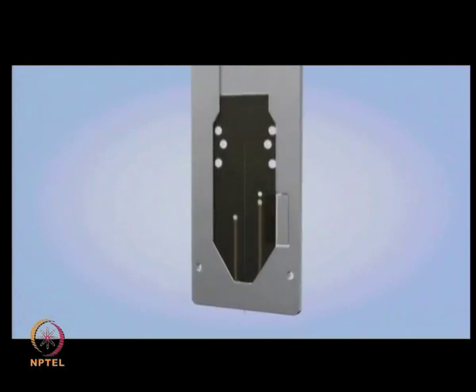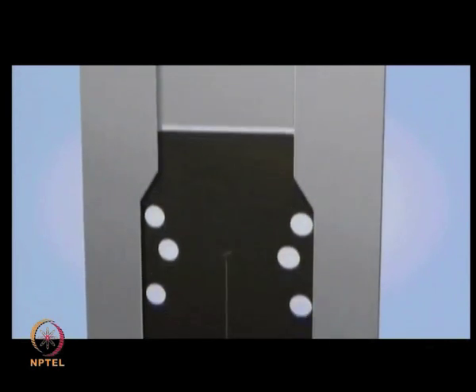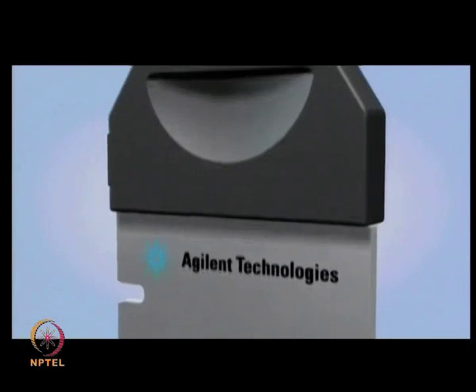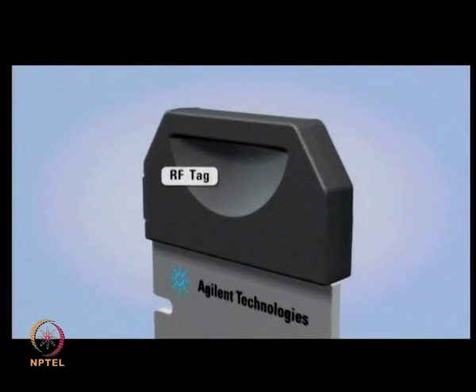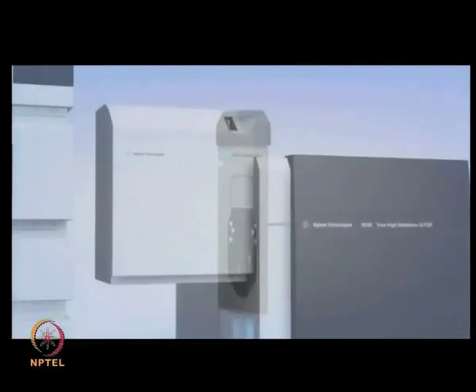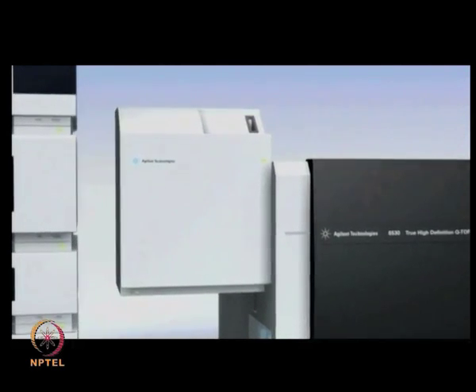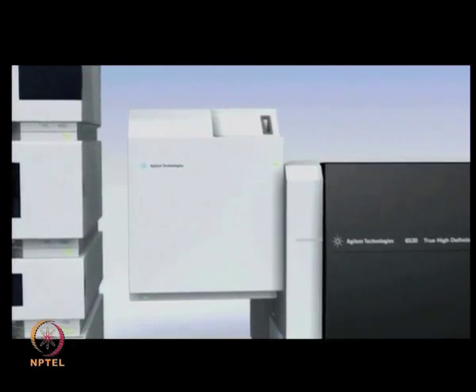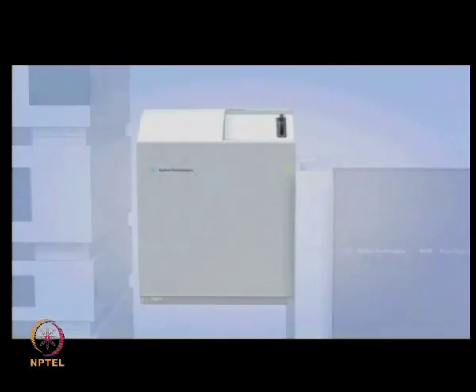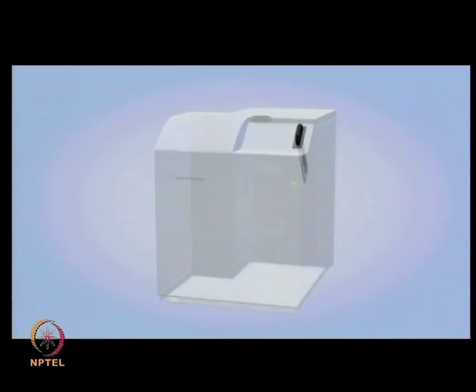The HPLC chip also incorporates all electrical contacts for the nano-electrospray tip and features an embedded radio frequency ID tag that tracks the usage and operating parameters of the chip. The chip cube includes an electrospray ion source with optics for spray visualization, HPLC chip loading and ejection mechanism, nano LC connections, and microvalve switching.